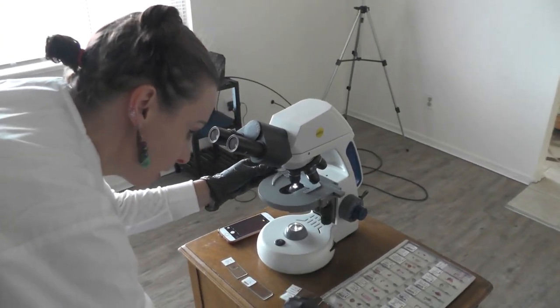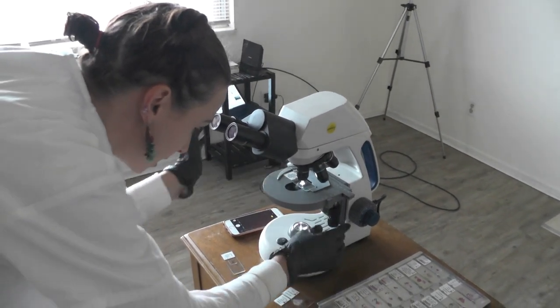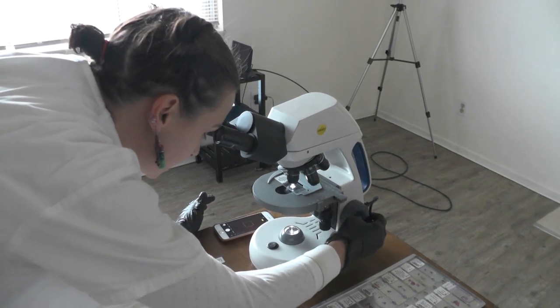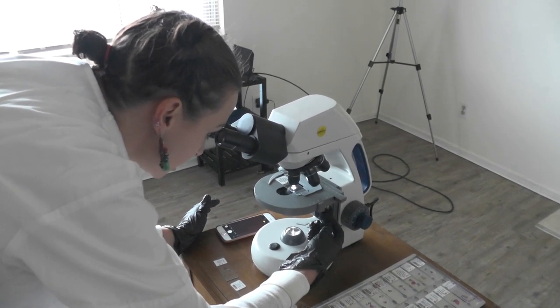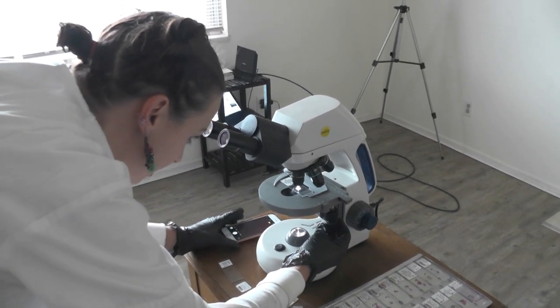So then from the stomach, let's go to the small intestine. We're just going to look at small intestine and the small intestine has a lot of goblet cells. It stains more darkly than the stomach a lot of the time and it looks a lot more glandular. So it's pretty easy to recognize the difference between the small intestine and the stomach.